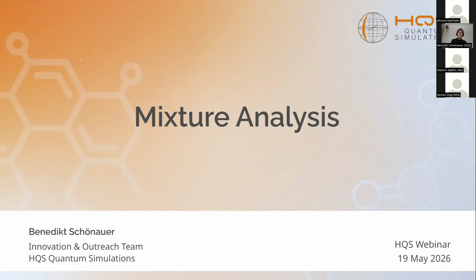And these NMR Hamiltonians are obtained from this QMSA procedure that Nico talked about. And if we're doing this, we need three things. We need experimental data that is useful and properly processed.